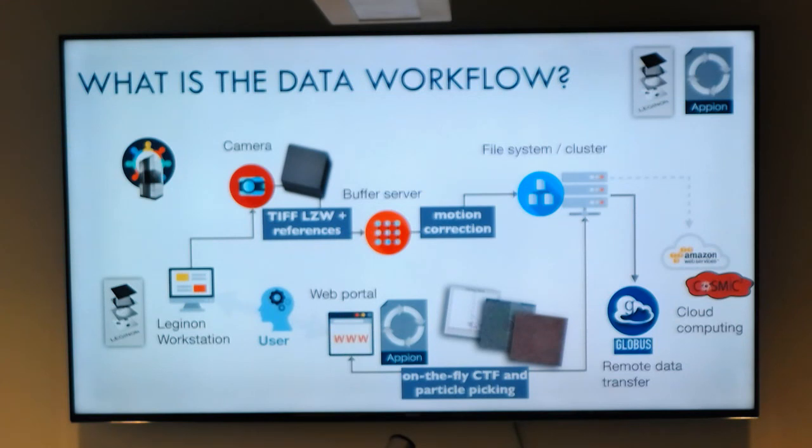So that speaks more towards what we're trying to do today, which is fill in the rest of the criteria and give you more of that 3D feedback to understand your data sets and your samples, such that you can prioritize and spend time on it wisely. Hopefully also, to wrap up, you know how to use Globus to get your data, and where your data is in the pipeline. Right now we were using Amazon Web Services, but there are other services like Cosmic and other on-demand services that you could make use of.